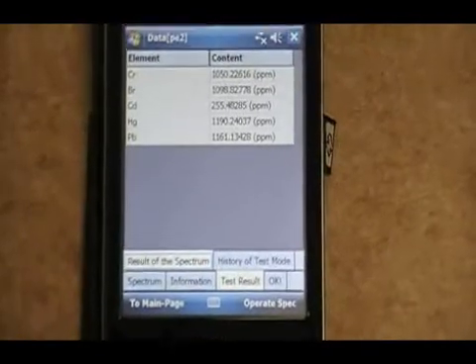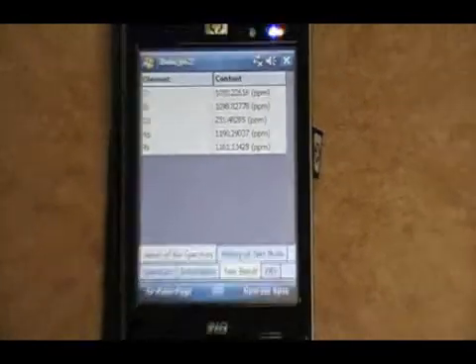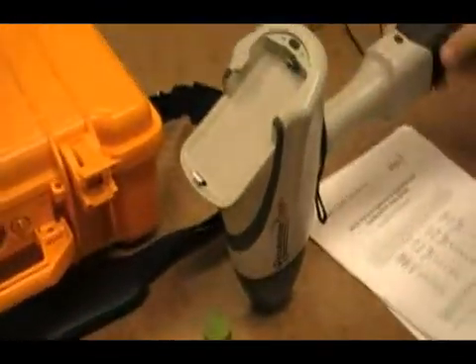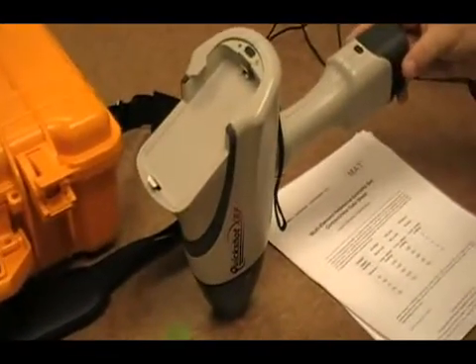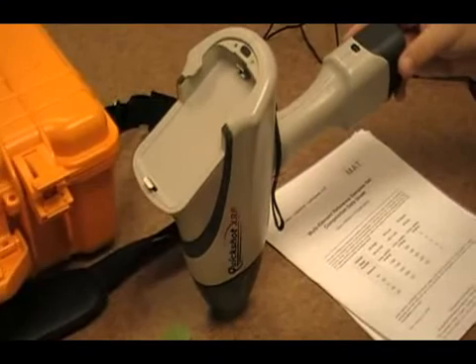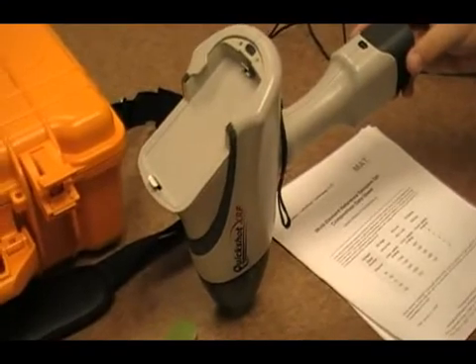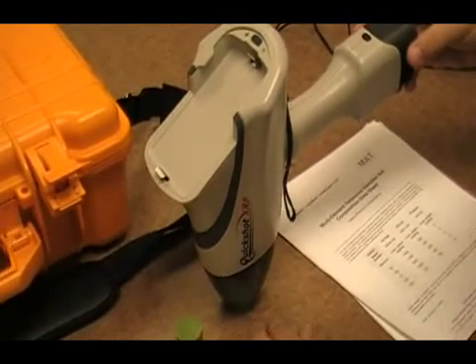I've gone through the data operation as well. We'll do more with that when we show calibration. And that's all I have today for the operation of the QuickShot XRF.